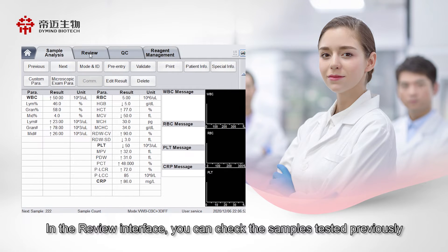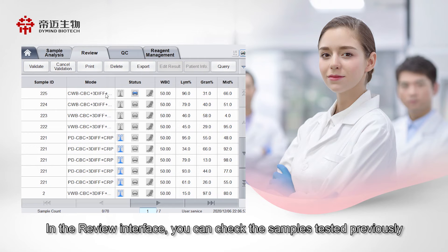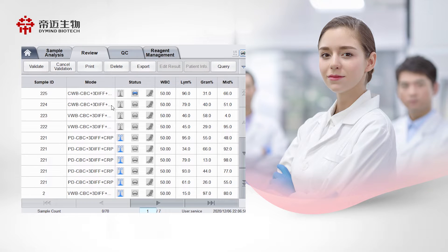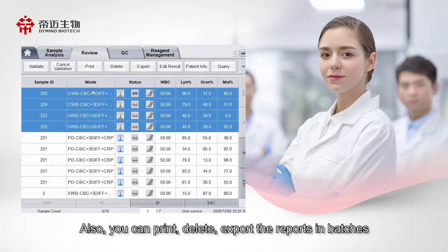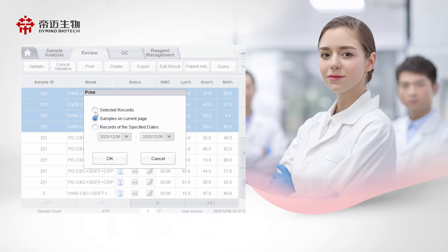In the review interface, you can check samples tested previously. You can also print, delete, and export the reports and batches.